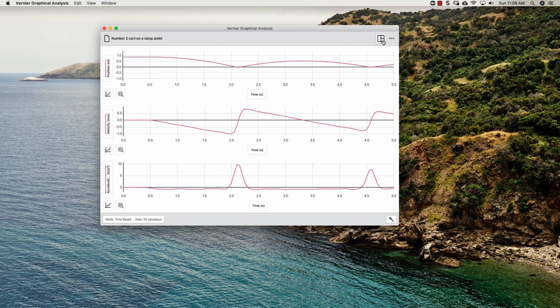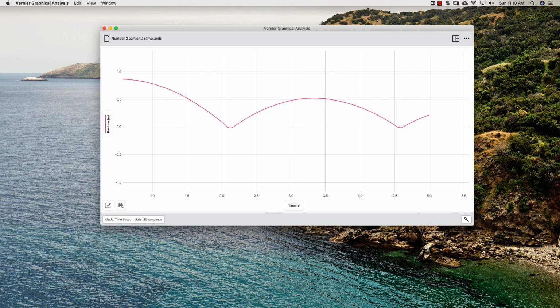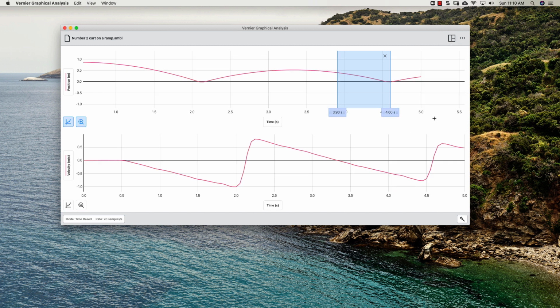Now we're going to come to the right, and we're going to look at this. This is what we call view options. Open this up, and you got several options. One graph. The screen comes into one graph. And this is an experiment, and I'm going to see if I can expand this a little bit. Whoops, not that way. This way, so expand my screen. And basically, now we just have one graph, and we'll talk about that later. And then you got 2, and you notice this. We're going to talk about those in a minute.